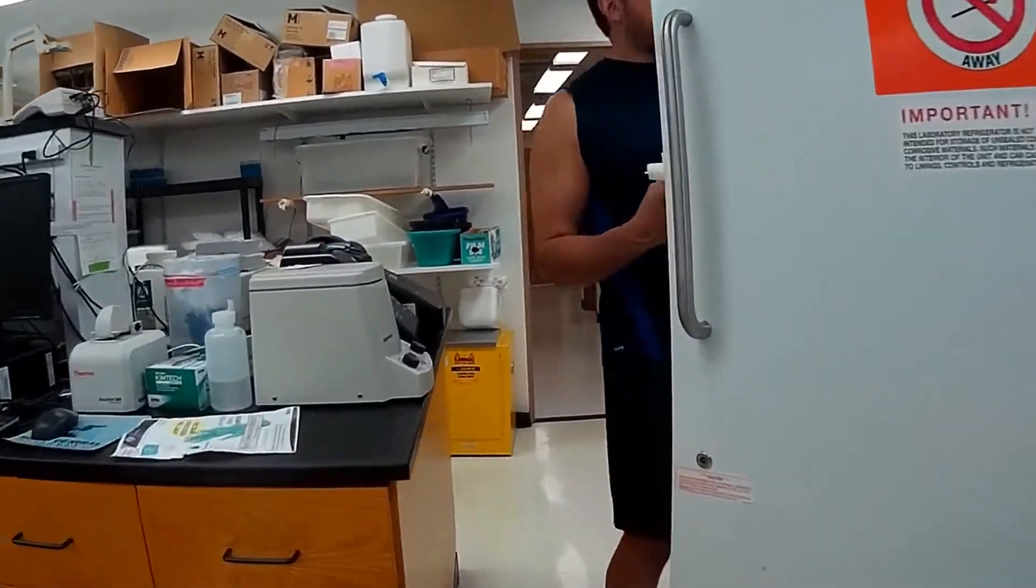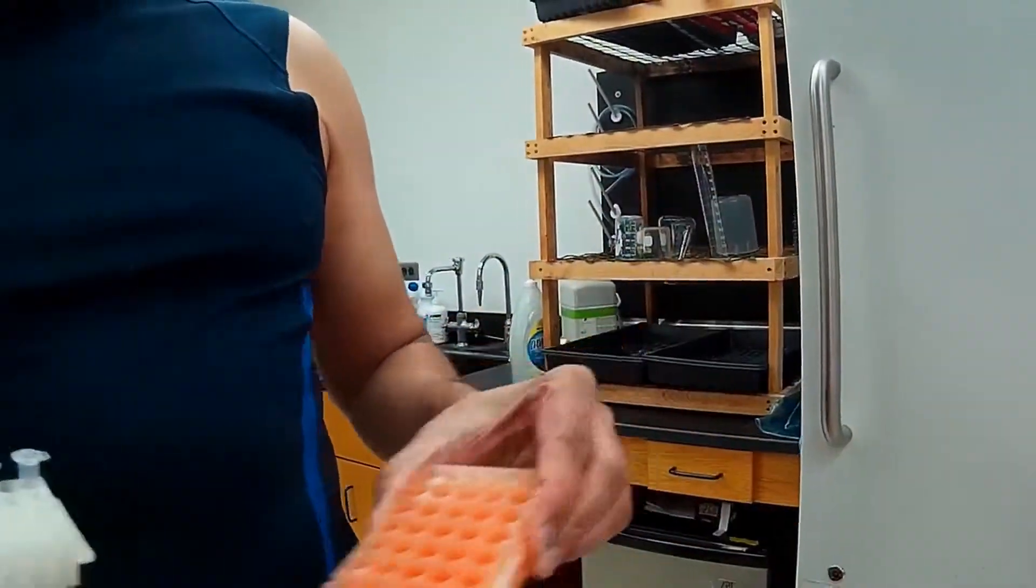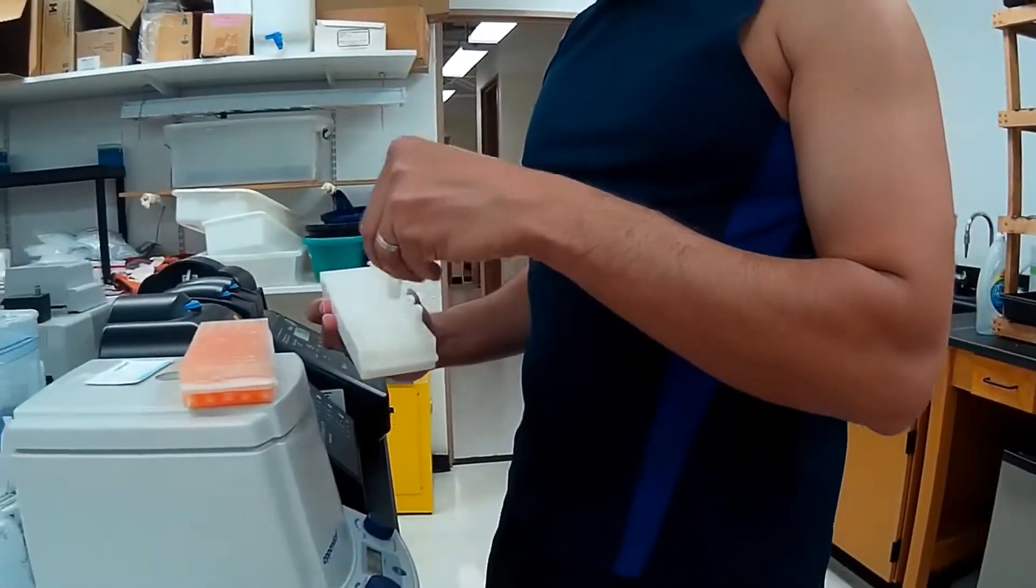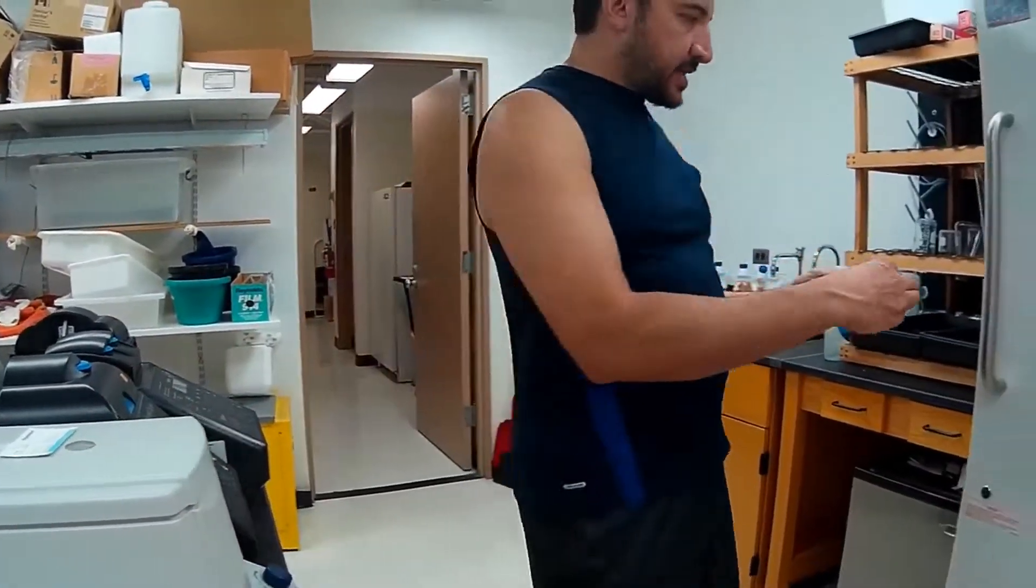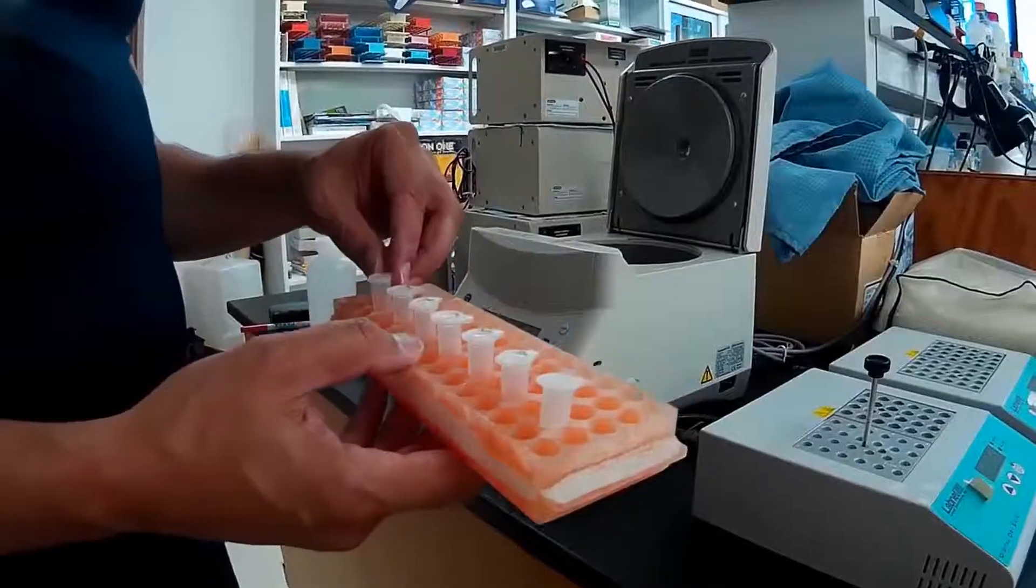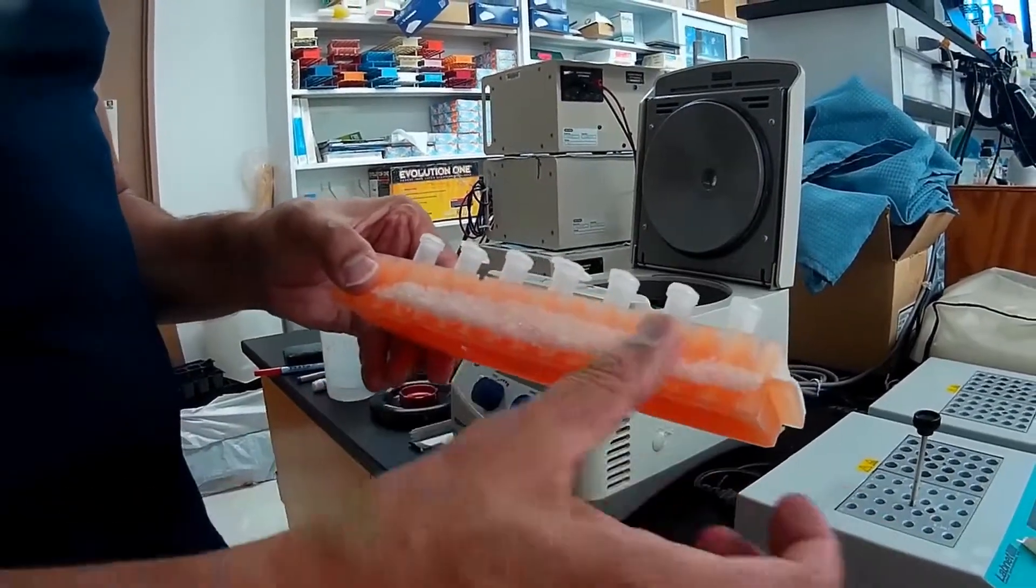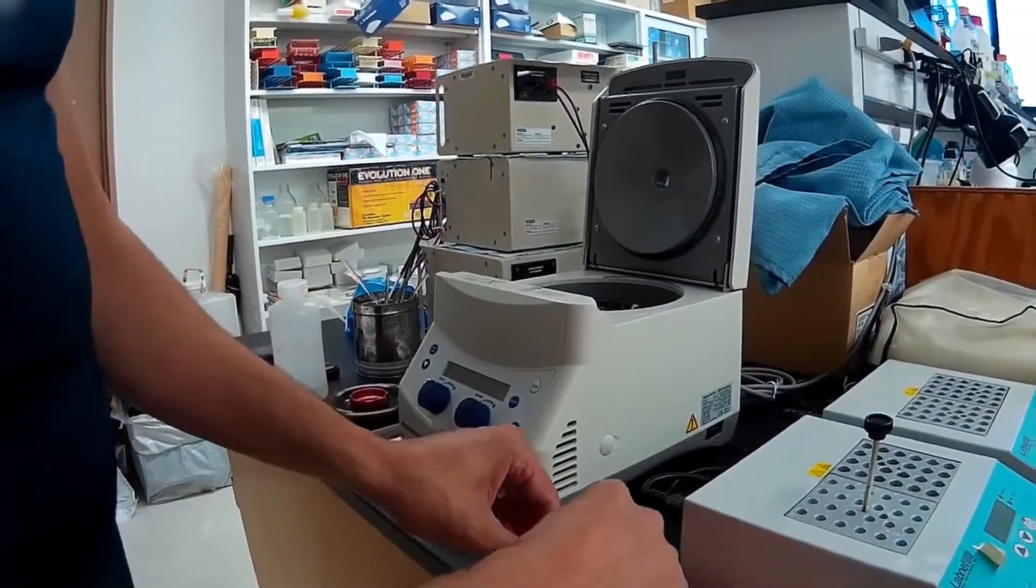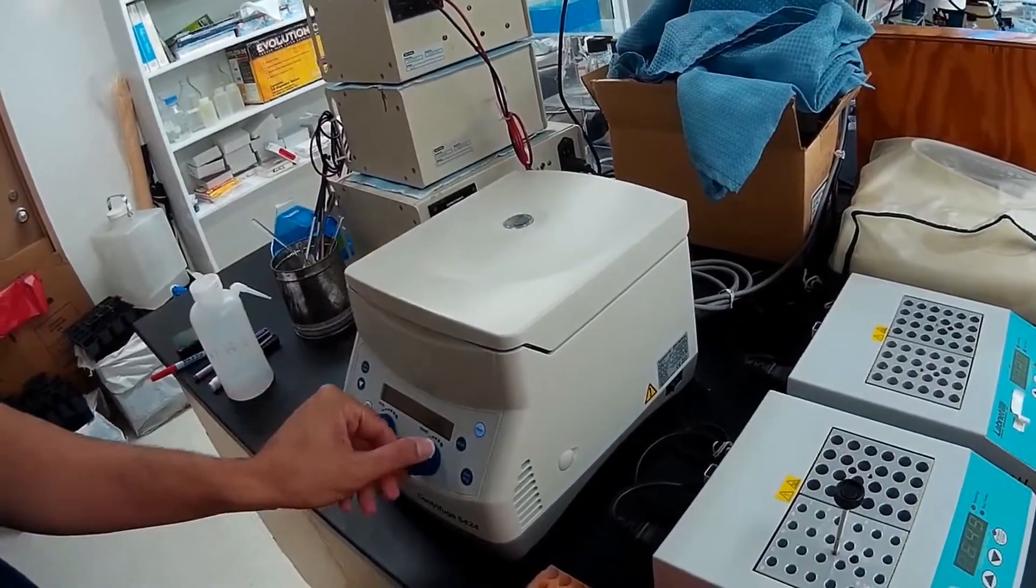Then the tubes will be put in an ice cold rack that is kept in the minus 20 freezer for one minute. This will further the precipitation reaction to get more of the protein and genomic DNA out of solution. Then the tubes will be spun at maximum speed for five minutes.